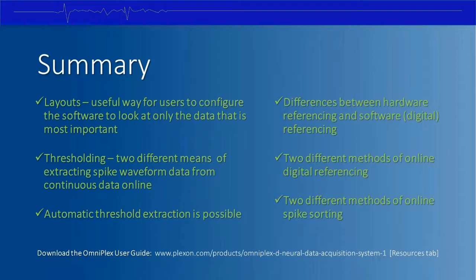We talked about referencing and the differences between hardware referencing and software or digital referencing. There are two different methods for online digital referencing. There's channel referencing. There's common average referencing or common median referencing.